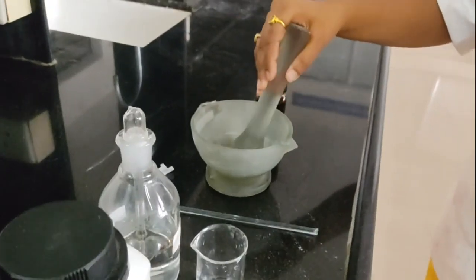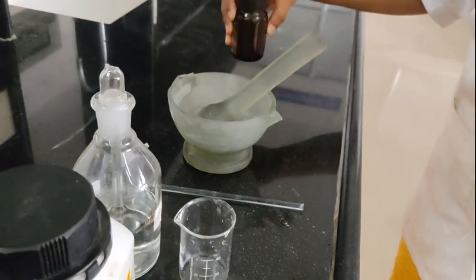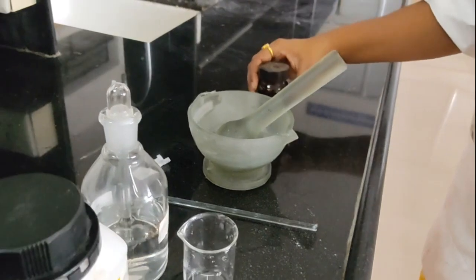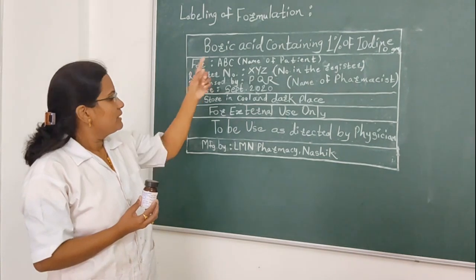Now after complete mixing of it, I am going to transfer it into this amber colored wide mouth bottle, and then we will proceed to the next labeling part. So we will move towards labeling of the formulation.